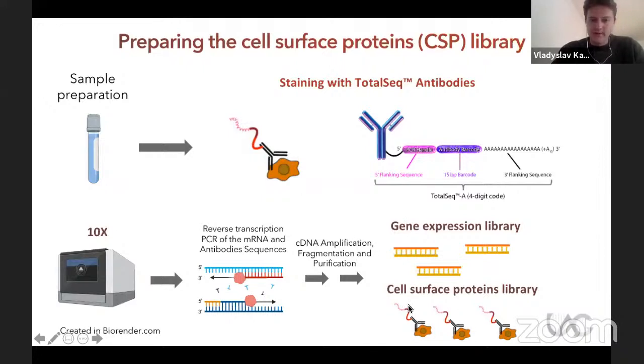So today we are going to analyze a data set out of cord blood mononuclear cells. It's something very special, but it is nothing less than blood that was taken from the cord. And then all the mononuclear cells, that means especially all the white cells that are in this blood, were isolated and then prepared via the CITE-seq workflow as you see it here.